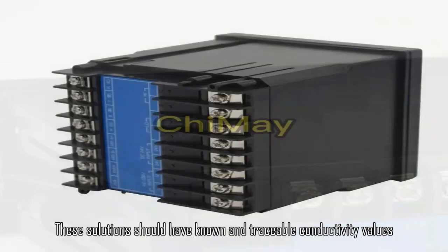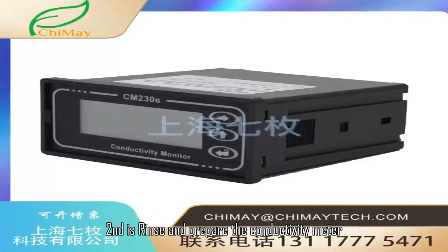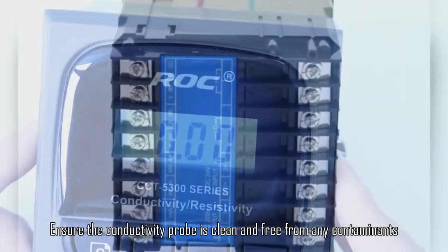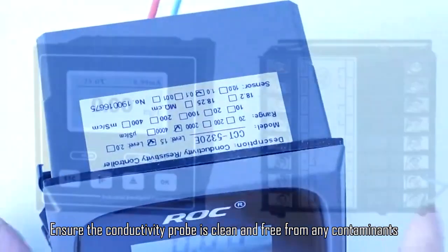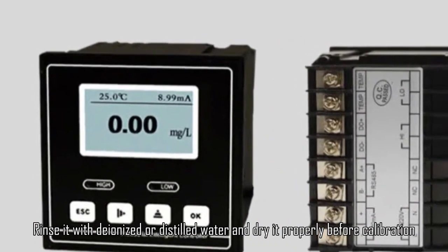These solutions should have known and traceable conductivity values. Second is rinse and prepare the conductivity meter. Ensure the conductivity probe is clean and free from any contaminants. Rinse it with deionized or distilled water and dry it properly before calibration.